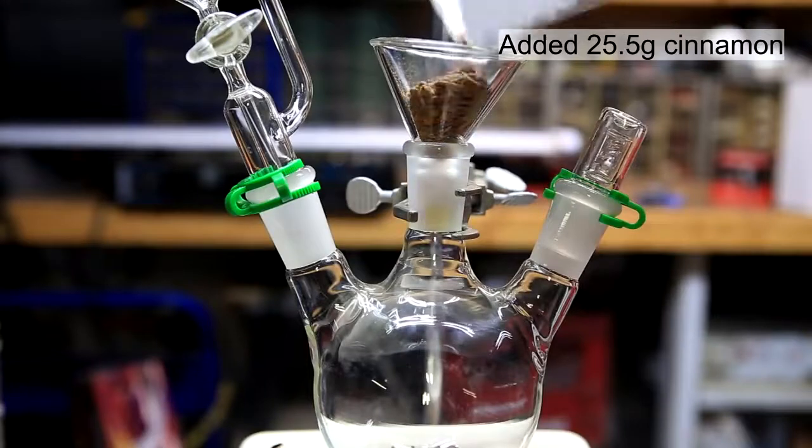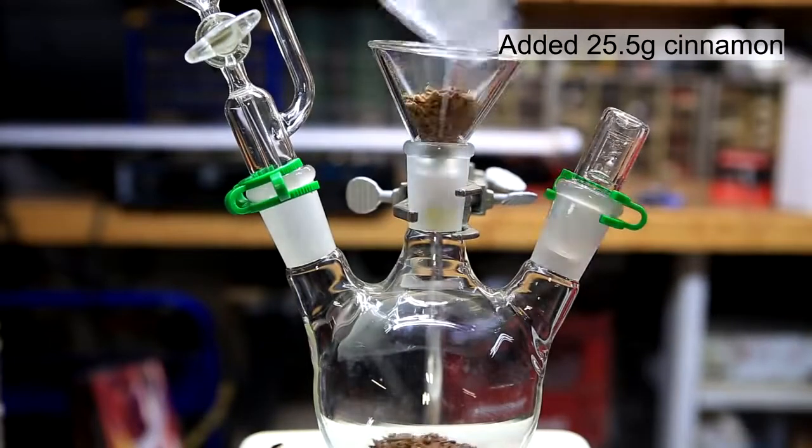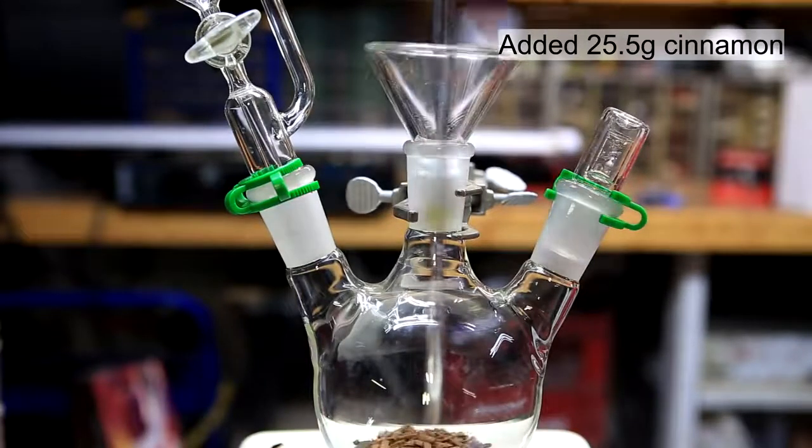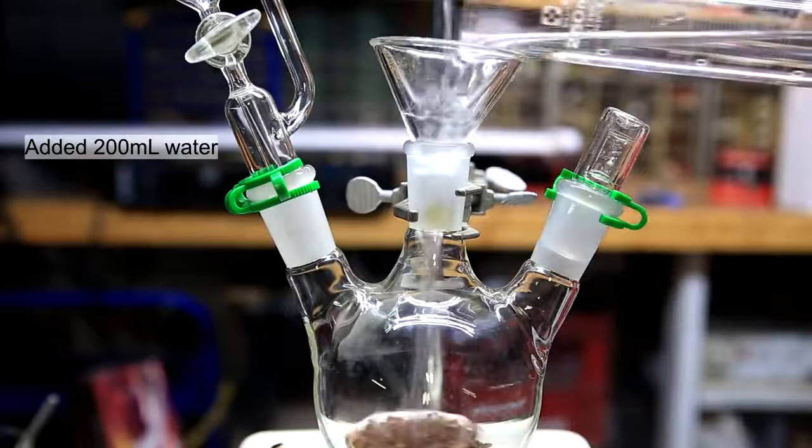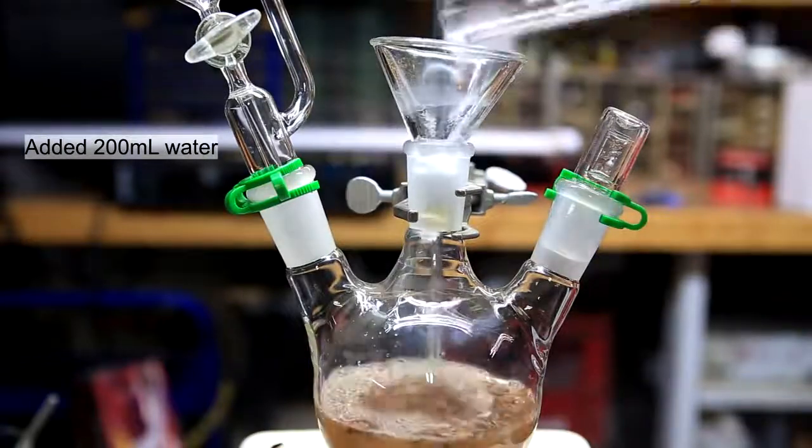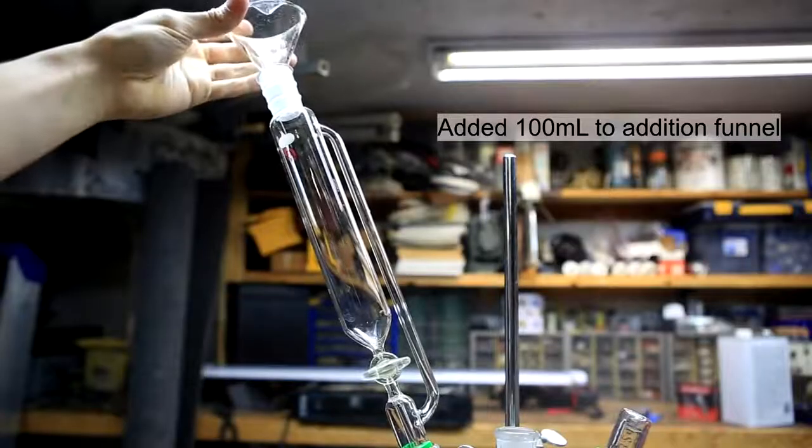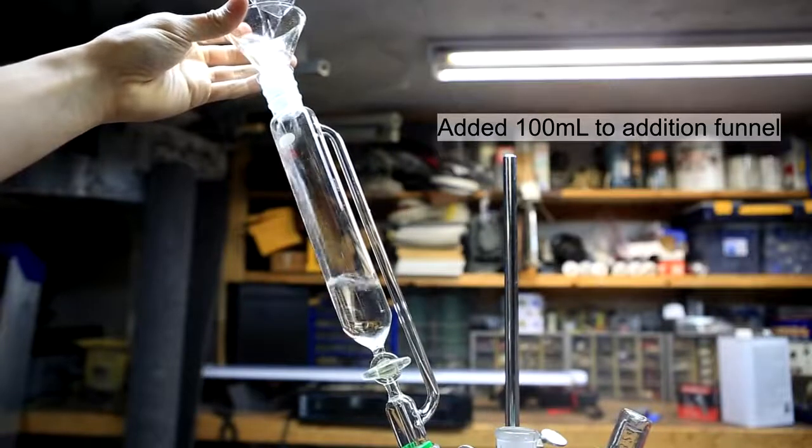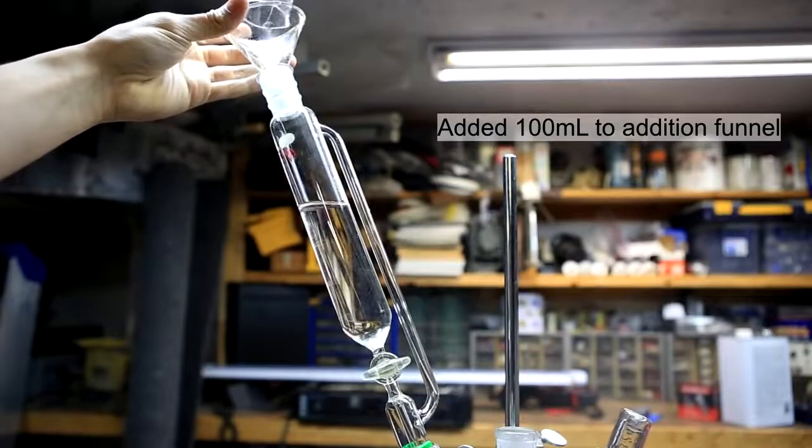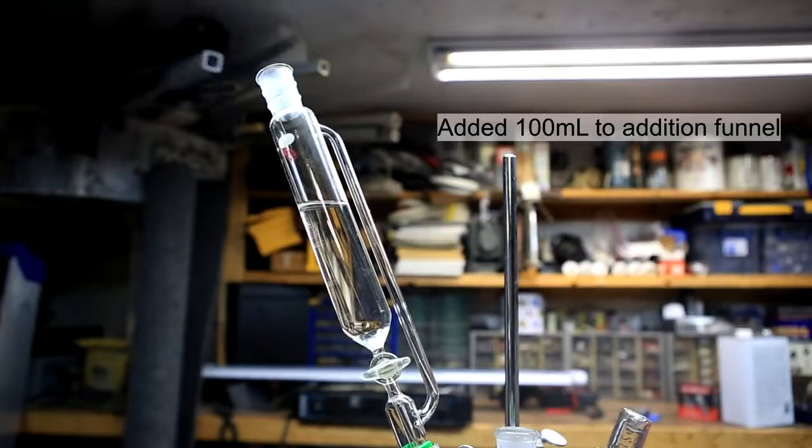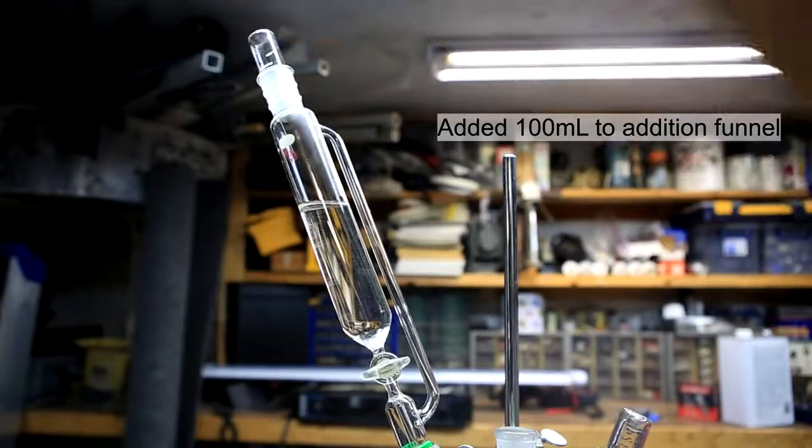After the cinnamon had been crushed, 25.5 grams were added to a three necked round bottom flask. To this was added 200 milliliters of distilled water. Then 100 milliliters of water was added to an addition funnel attached to one of the necks. However this extra 100 milliliters of water really isn't that necessary.